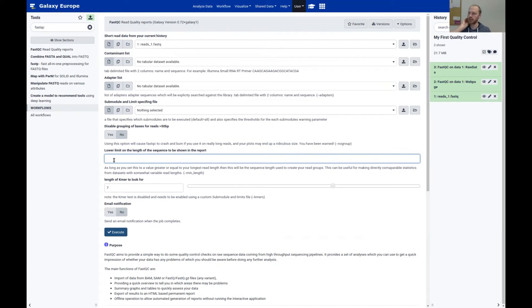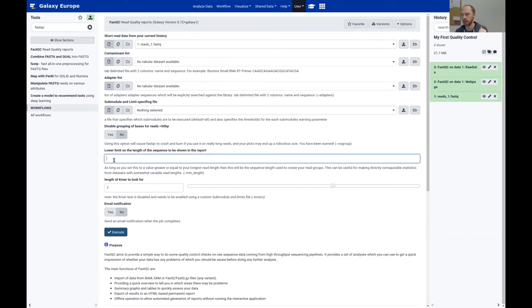If you have really long reads and want to see certain windows to compare with another experiment — say you have one experiment with 50 bases and another with 200 bases — you can set the length limit for the 200 base pair experiment and look only at 50 bases. This is what that option does.